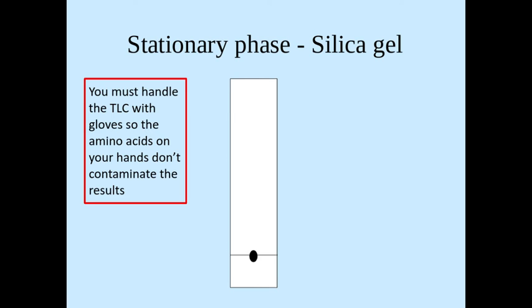We must draw the line with a pencil so that the line doesn't get dissolved within the solvent which is what is added next. We must handle this thin layer chromatography made with silica gel with care because amino acids on our hands might contaminate it and we don't want that to happen.